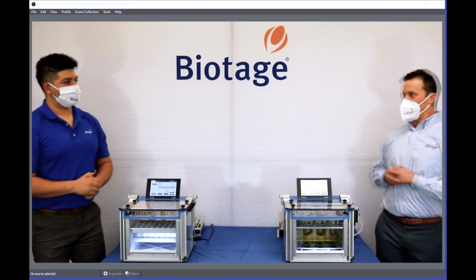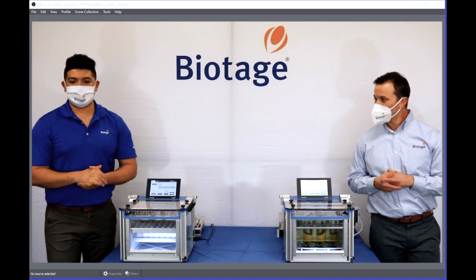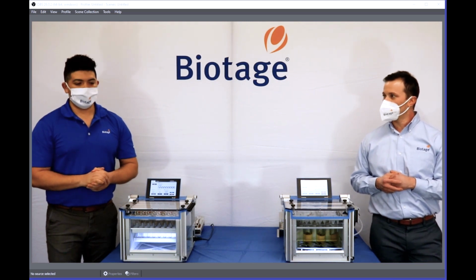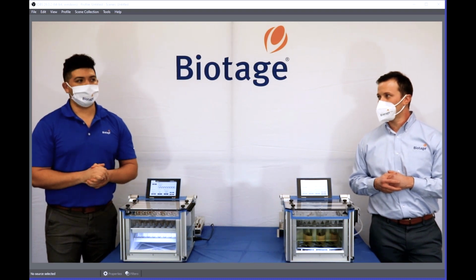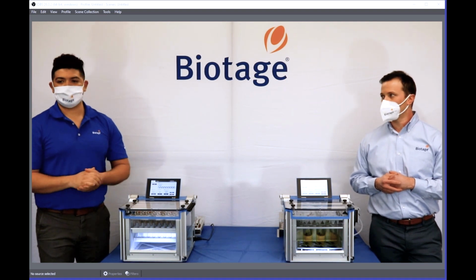You wanna take that, or okay? I'll let you take it. You have the option of using both. What we would recommend though is to use nitrogen. It's a cleaner source, and it avoids the possibility of contaminating the samples from dirty air. So you have the capability of using both, but we would highly recommend using a clean source like nitrogen.